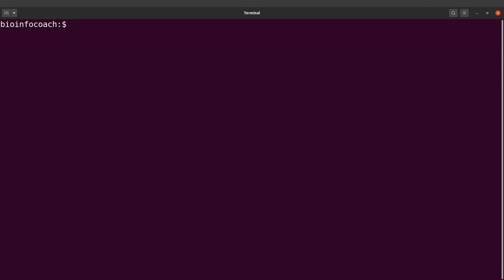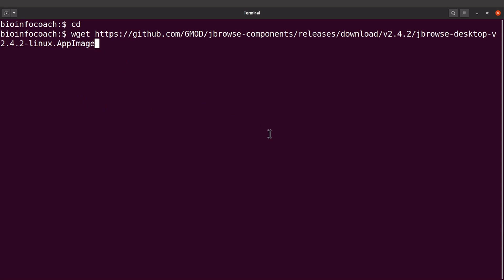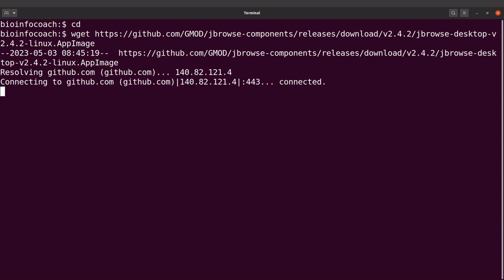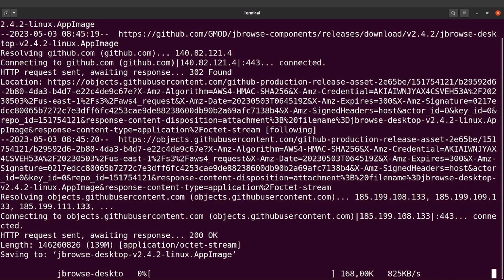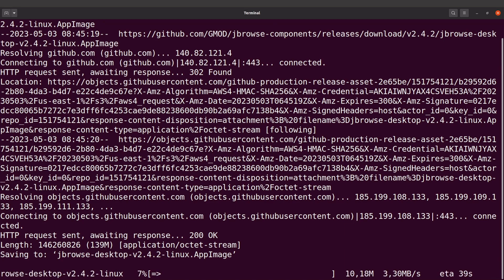On the terminal, I'll cd to my home directory, then download the executable file using wget, supplying it with the download link I copied, and execute the command. This is going to download JBrowse.